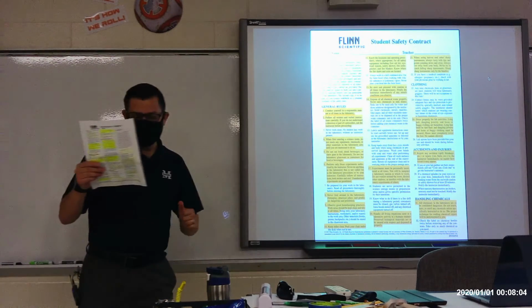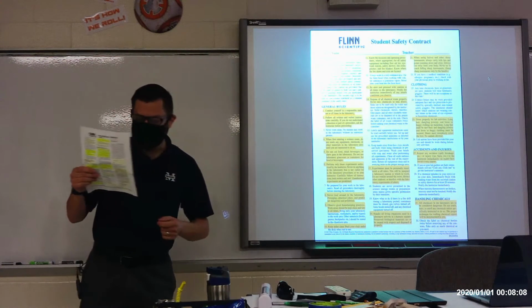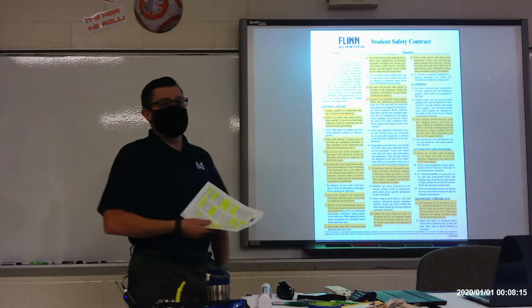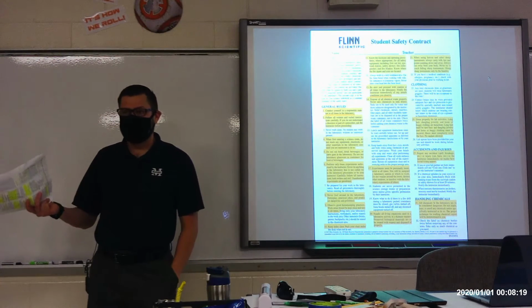All right, number 5, do not eat food, drink beverages, or chew gum in the laboratory. Do not use laboratory glassware as containers for food or beverages. In general, at McKeel, you shouldn't be eating or drinking in the classroom.